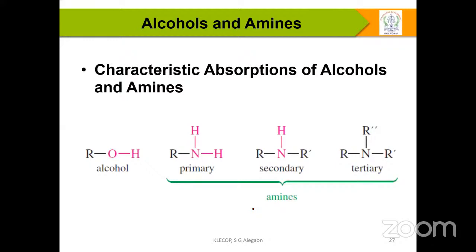Alcohols and amines are very important in organic chemistry in other senses too. One should understand whether they are bonded or non-bonded, that is, whether they are internally or externally hydrogen bonded or non-hydrogen bonded. Usually we call it free OH or bonded OH.